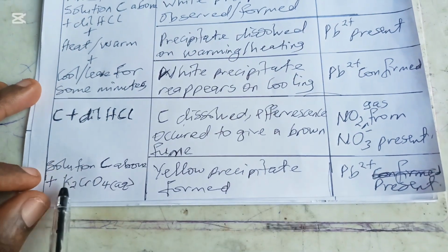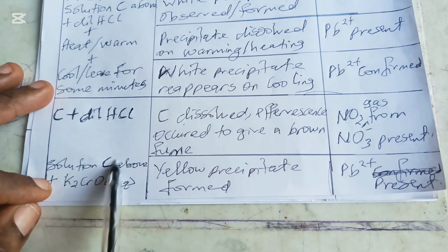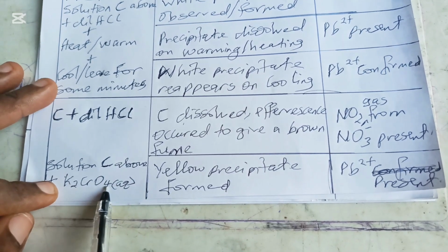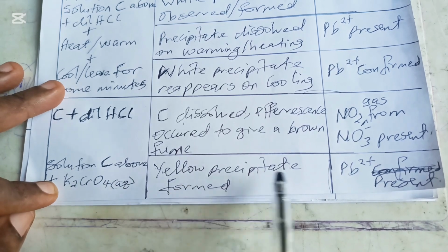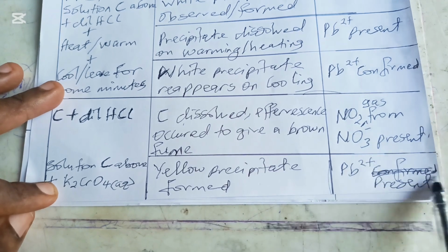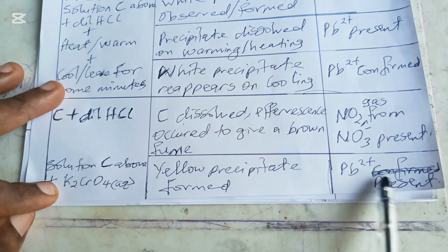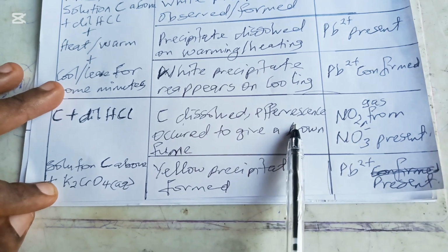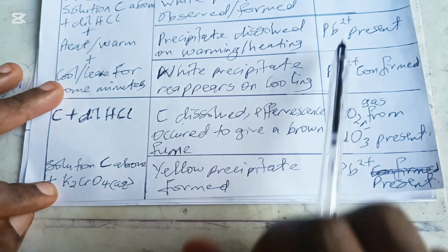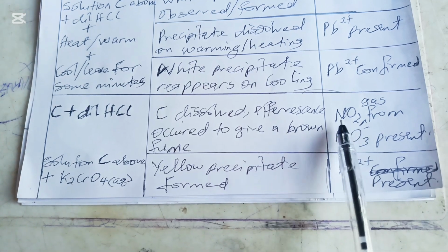Now, I intentionally put this. They might say solution C above. They might take any portion of the solution C that you have dissolved earlier above, plus K2CrO4 aqueous. Yellow precipitate must be observed. Now, Pb2 plus, I intentionally wrote confirmed and crossed it because confirmed is not correct, because we did not suspect it. They might ask you just like that. You can only confirm if you have suspected lead from the above and it is a continuity. That's as far as C is concerned.